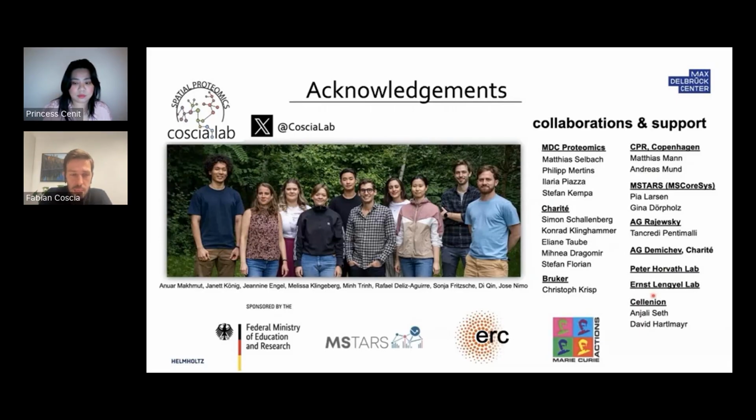The additional topic is, of course, how we process the samples. How do we deliver them to our machines? So here we will also likely see more improvements in sample preparation. Robotics and automation are really a huge topic. And then in the end, machine learning-based tools to make sense out of all this very complex biological data, right? So we need new models to really leverage these protein-centered data.